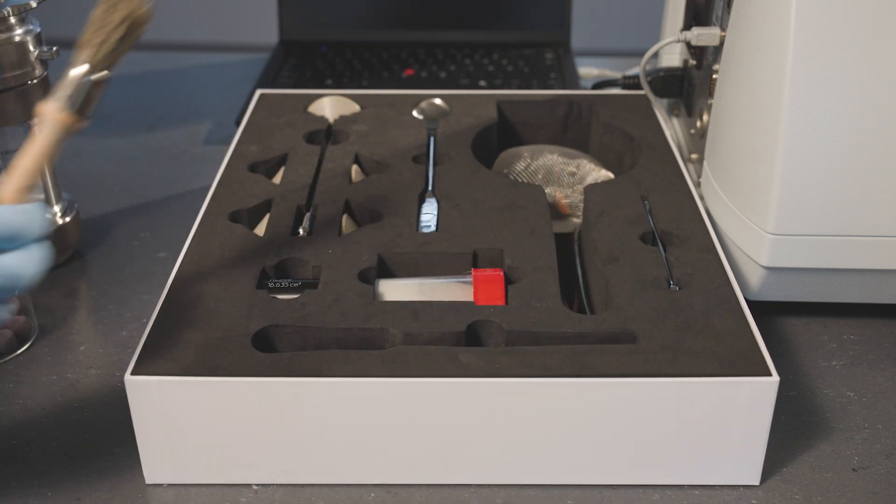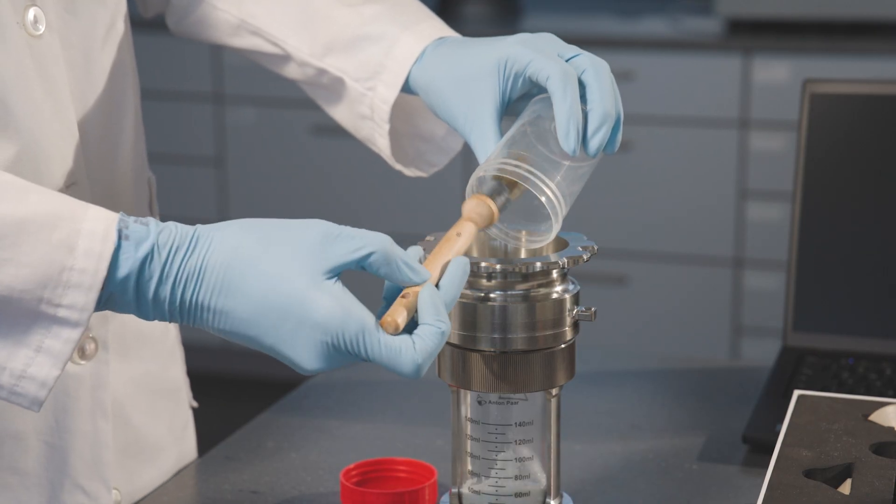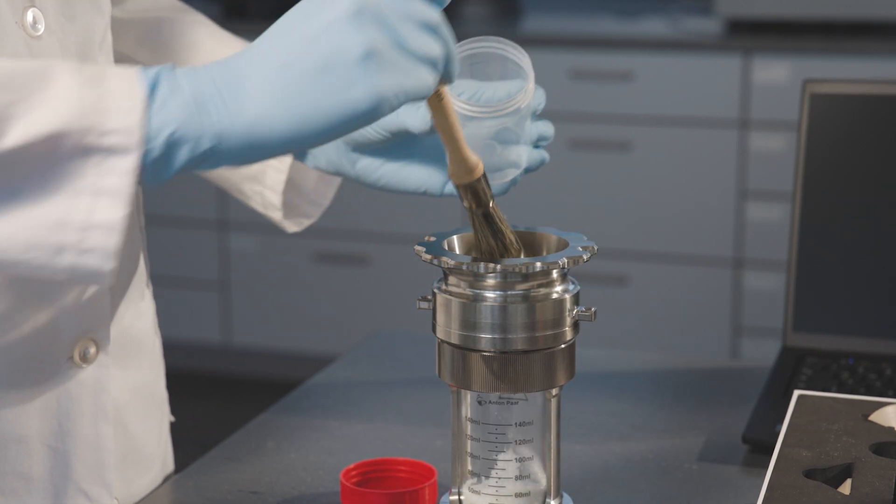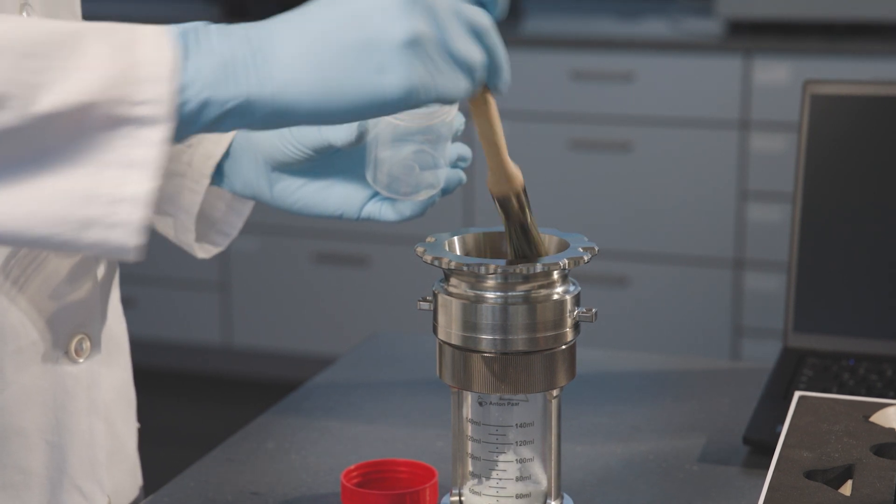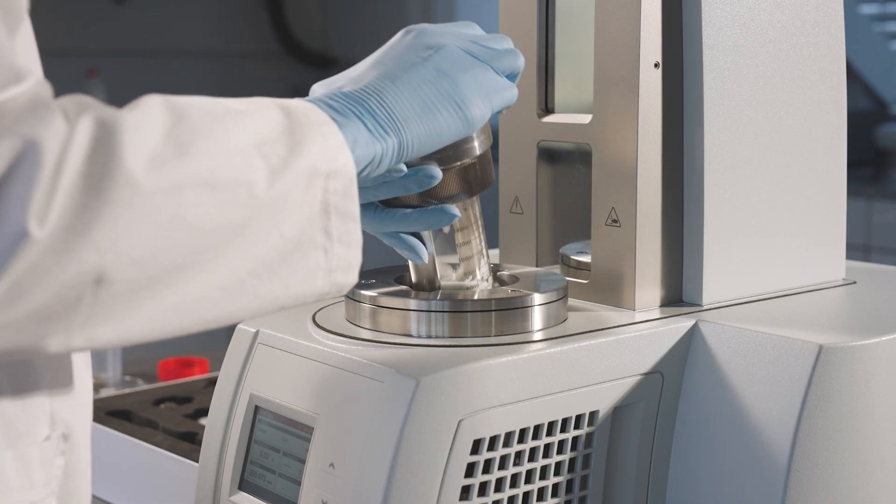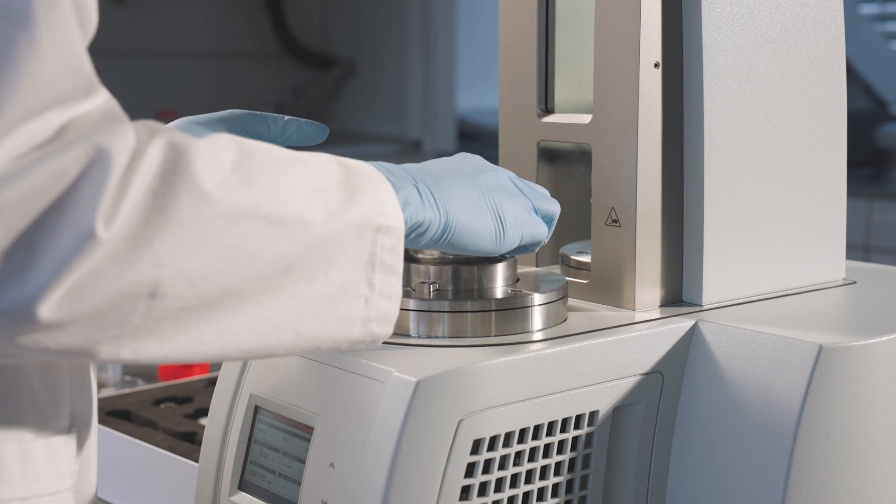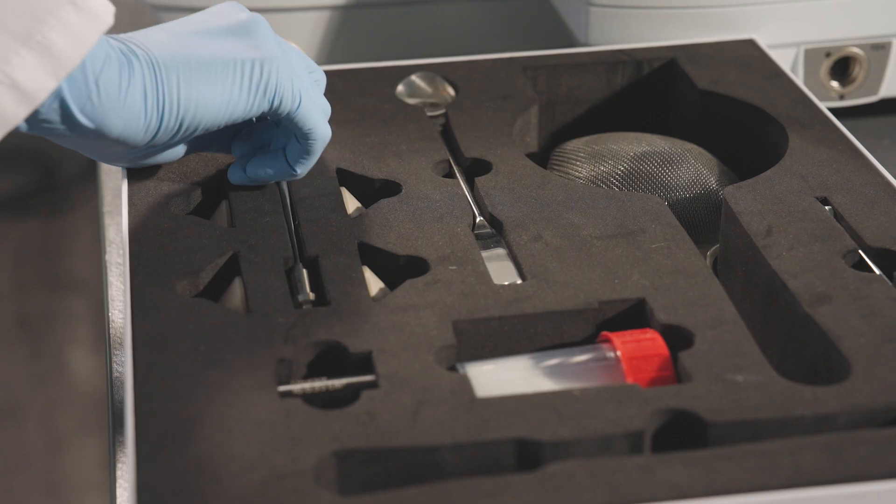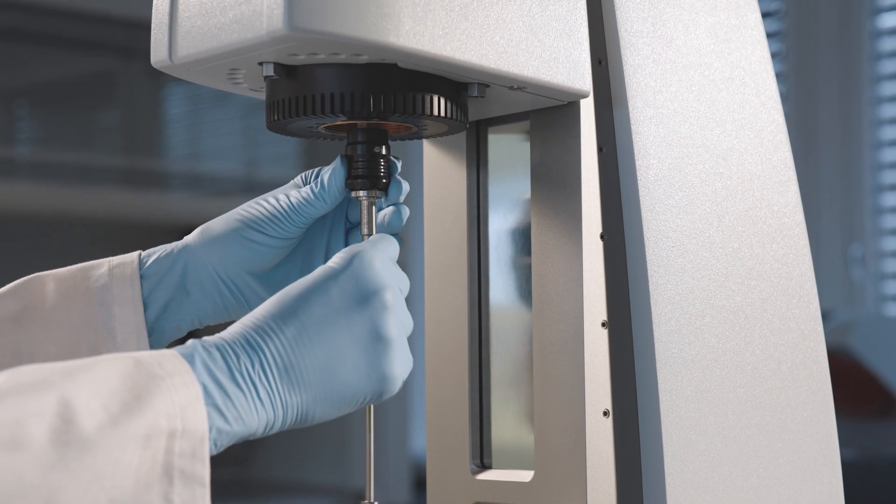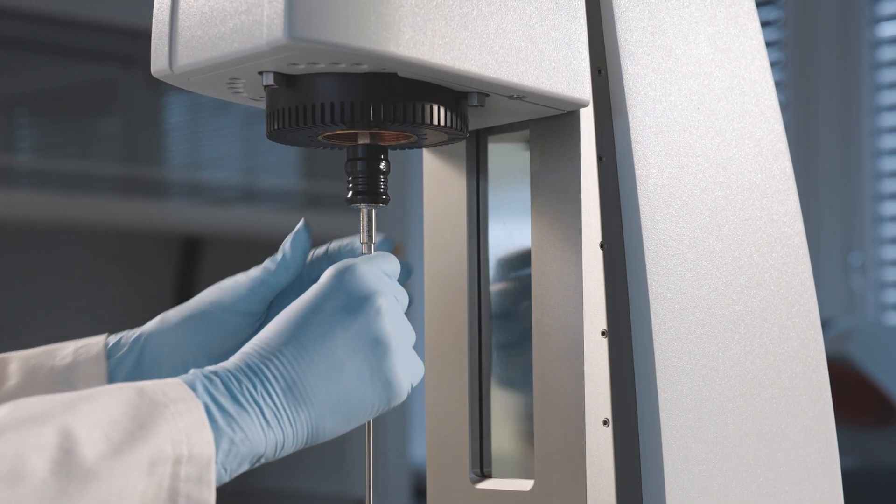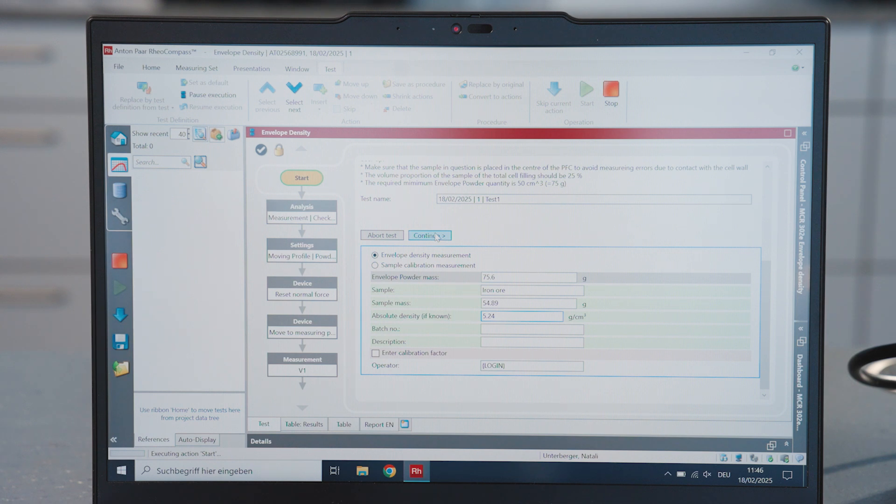Use the provided brush to prevent powder loss. Install the powder flow cell in the measuring cell holder. Mount the measuring system. Start the measurement with Continue.